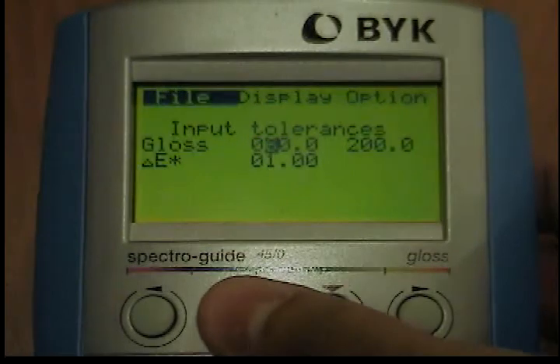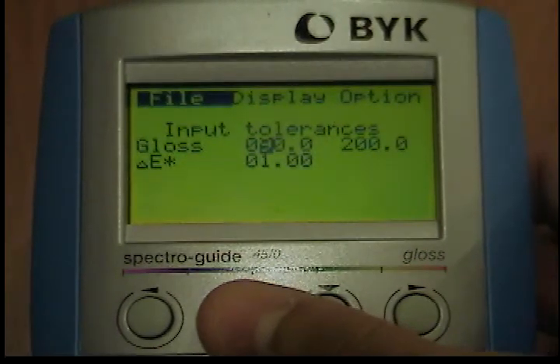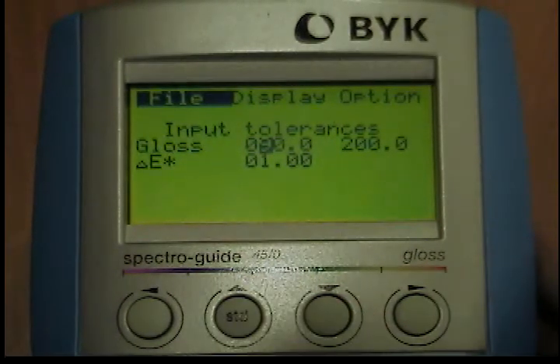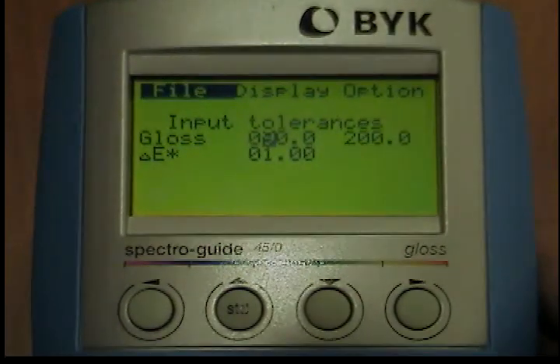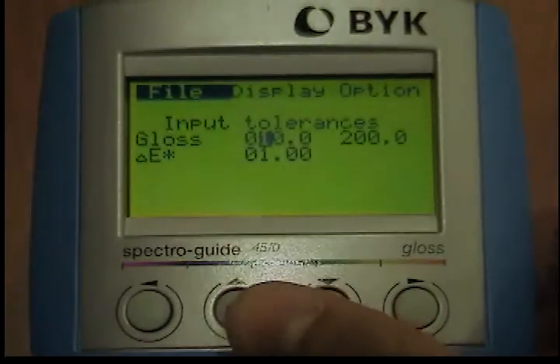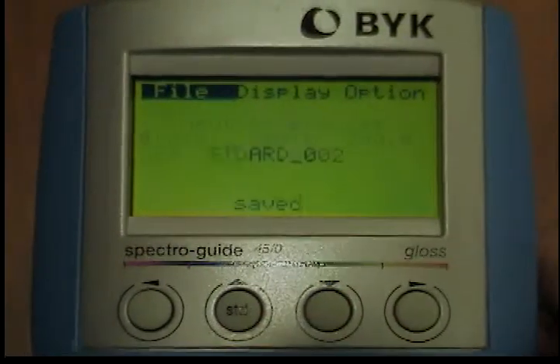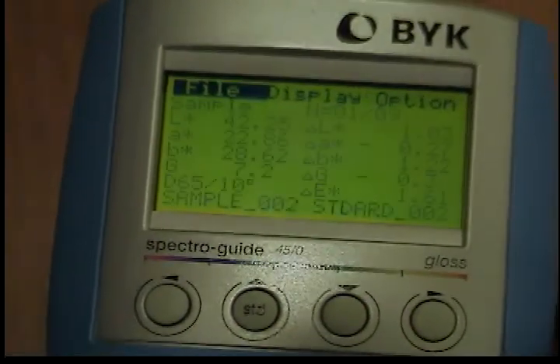The procedure for storing samples is similar except that no tolerances are entered. You can use the File, Save, Sample, Standard function to save a sample reading as a standard.